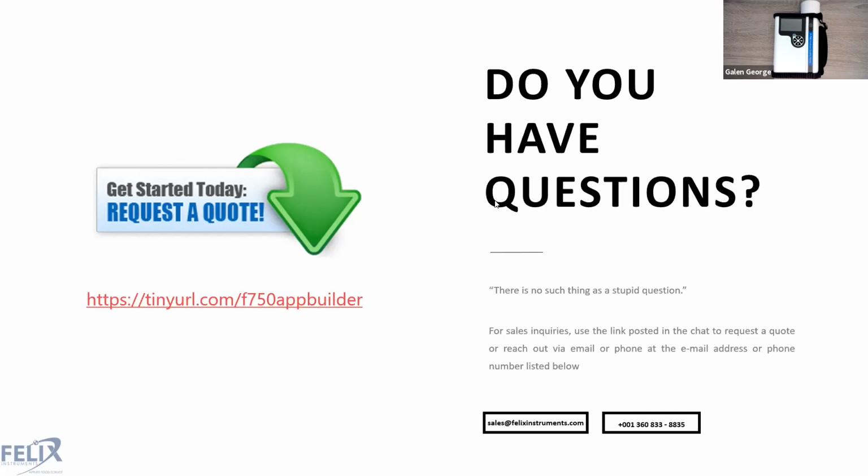Hi, we are interested in a non-invasive, non-destructive instrument for measuring total sugar levels in agave plants directly from the field. What instrument and apps would you recommend, and is there any possibility of testing it? Agave is going to be tough, mostly because of the form factor of the instrument.